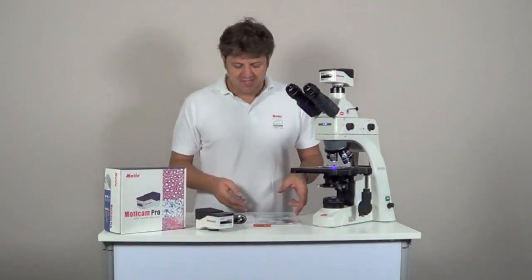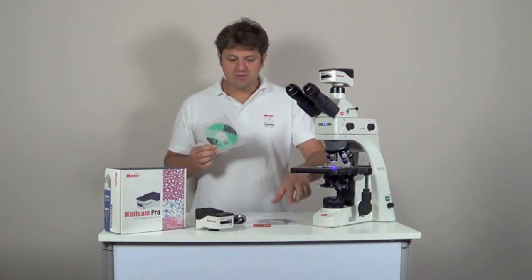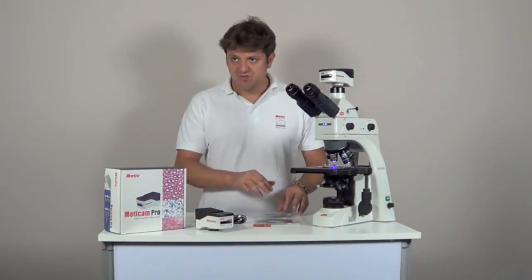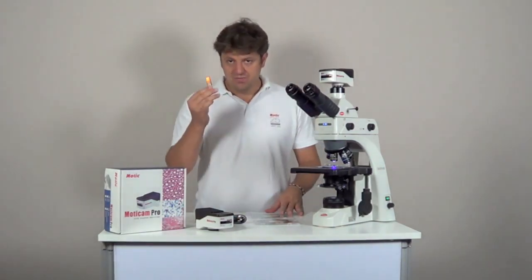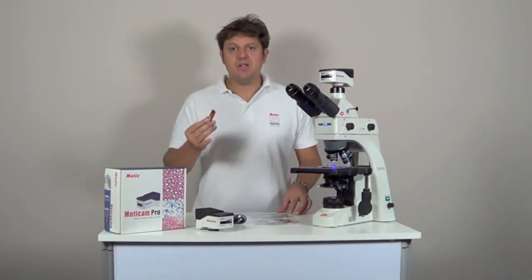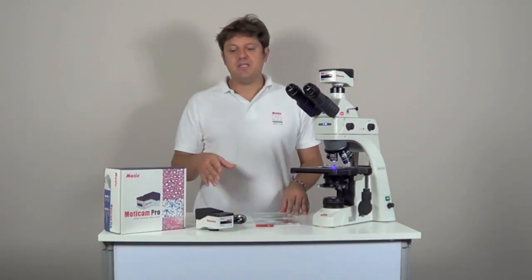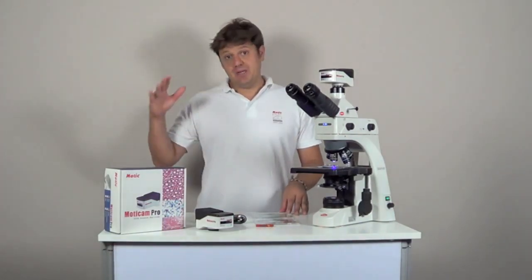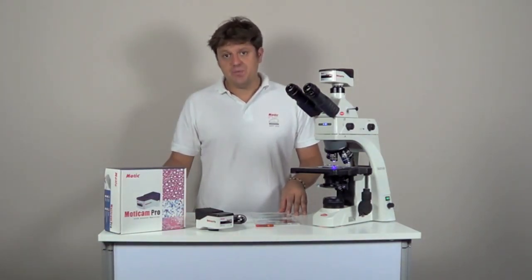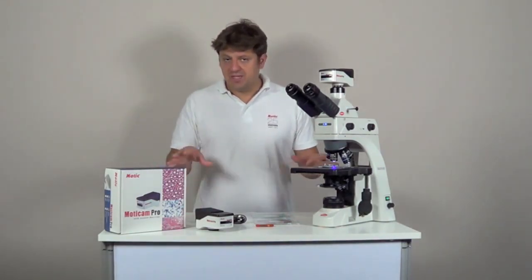All Moticam Pro cameras come with the software Motic Images Advanced 3.2 and also with Motic Images Plus 2.0. To work with the Advanced 3.2 software you need a dongle key which is included in the package, and without this dongle the software would block. Just as with Moticam CMOS cameras, all Moticam Pro are compatible with other software using the universal drivers Twain and DirectShow, and the SDK software is also available to program the camera yourself.